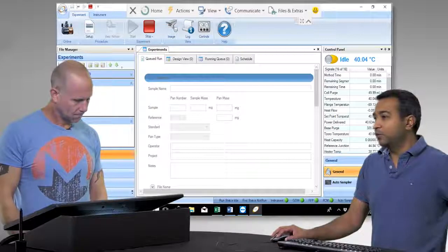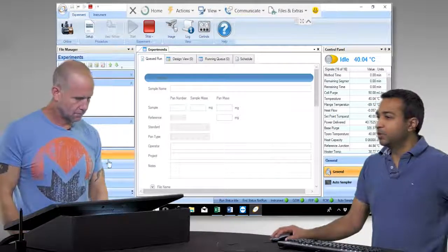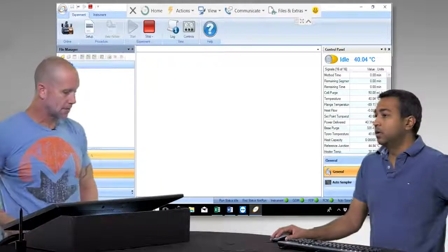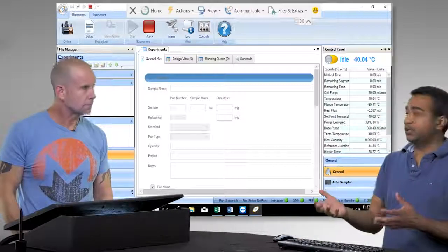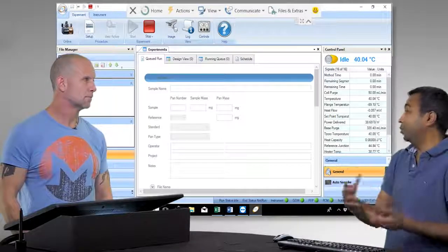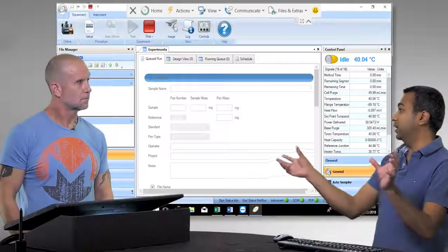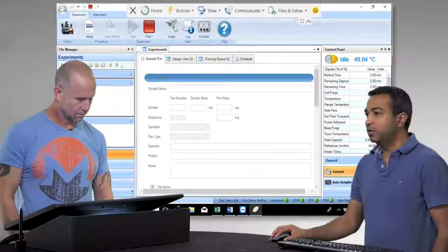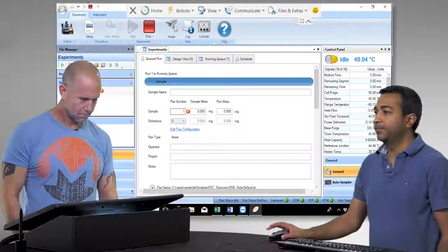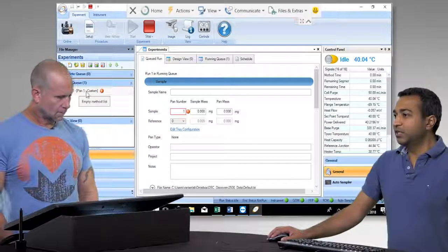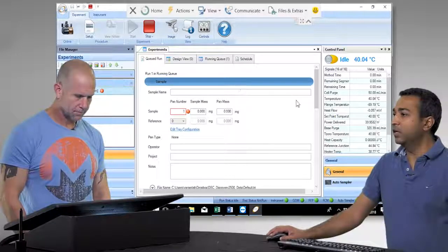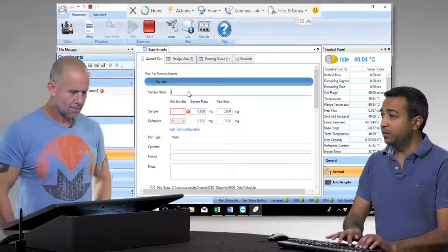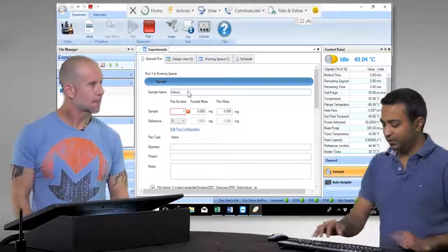To set up an experiment in the software, go down to the experiments tab. Typically when you load the software you might be in the results page, and you can have a whole series of results and even look at those while other experiments are running. Going back to the Trios software — it's made to overlay data from multiple instruments. If you have a TGA and a DSC, you can take both thermograms and overlay them on the same plot. To set up an experiment, go to the experiments tab and create a new run. It comes into a view where you fill out information about your sample.